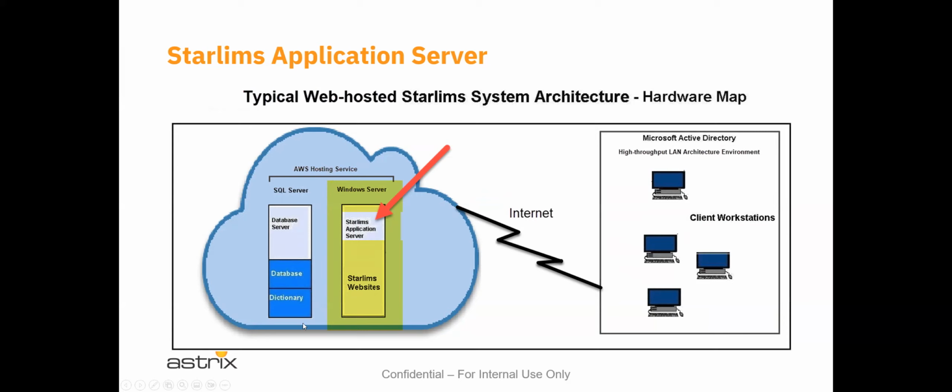And they essentially host the server and the databases, and through an internet connection, they attach to the internal Microsoft Active Directory at a local client. So it can be handled virtually, thereby eliminating the need for a client to actually manage servers or own servers or do anything of the like. And they are definitely going towards this model now. Although there are a few folks out there that really feel they need to have total control over the application server, and they still host them internally.